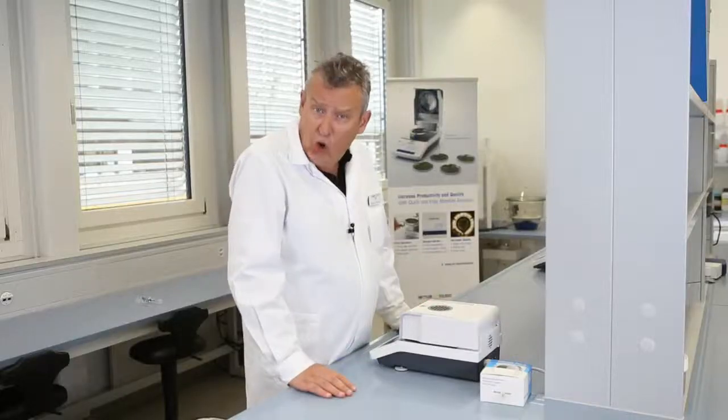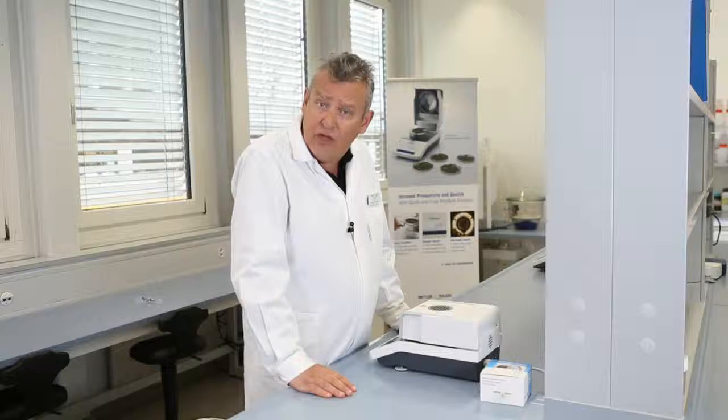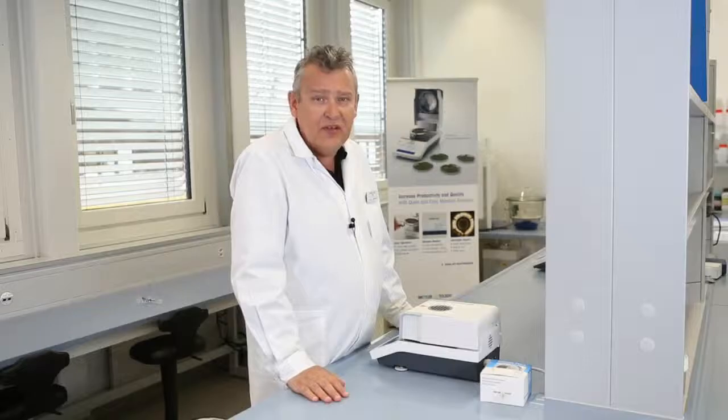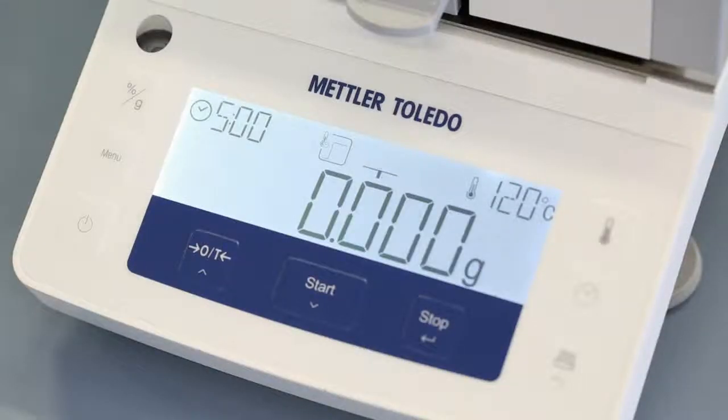These are the most commonly used functions of the HE53, and as you can see, it's really very simple to use. You can also select between two drying programs: standard drying and rapid drying.